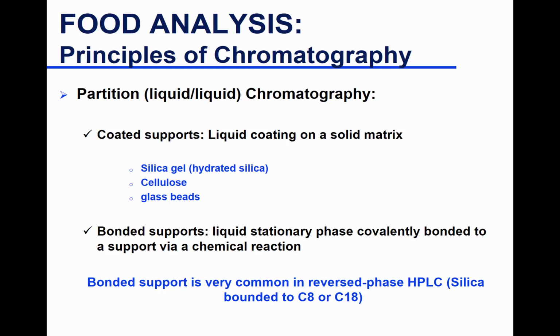Bonded phases are usually better. Bonded support is usually better because you don't have to regenerate the column. So you don't have to always wet your stationary phase or make sure there is a good layer that is not stripped off. So the liquid is not stripped off. So bonding your liquid is always a good call so that you don't have to regenerate the column, like I said.